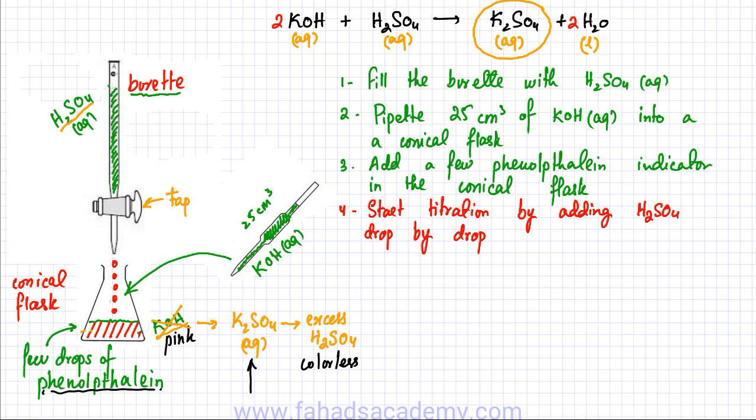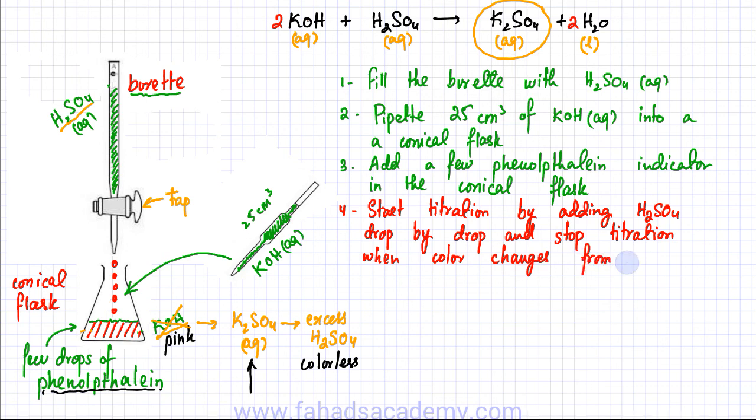So let's complete our description. You start the titration by adding H2SO4 drop by drop, and you stop the titration when the color changes from pink to colorless.